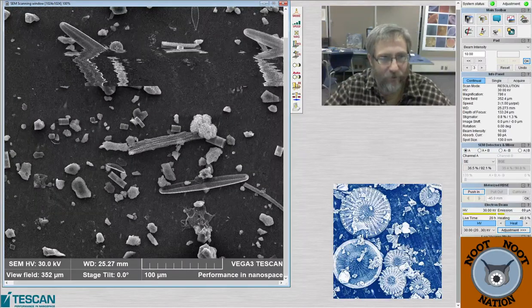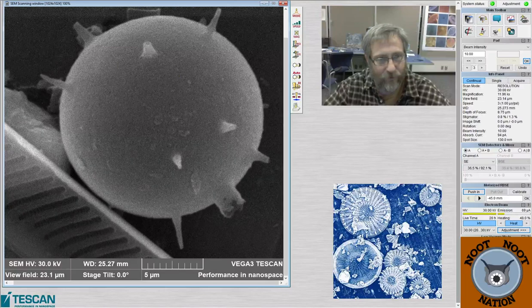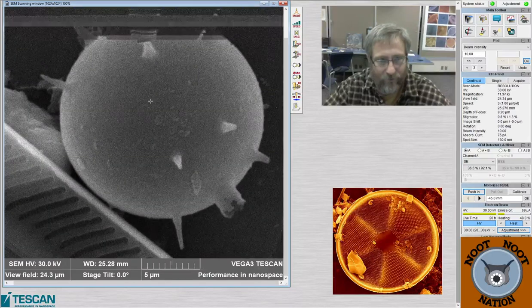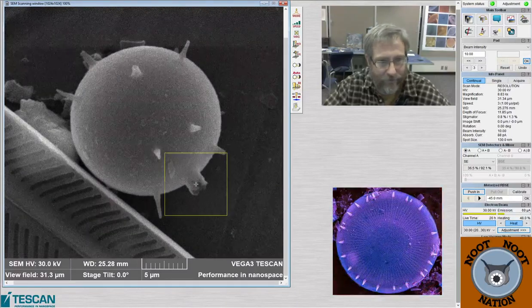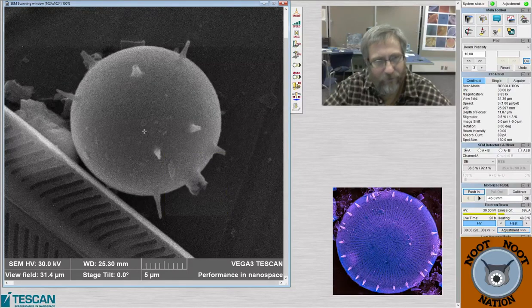I didn't spend too much time delving into it because it was just a project that I gave to Mallory to do, and when I handed it off to my photogrammetry person, they said, yeah, that didn't work. So you did something different, but I don't know what we did differently. It could have been something on the stage that was charging or creating a problem for the rest of the image. If there's a defect in the image, maybe it didn't know how to handle it. So it's a bit of a question mark what went wrong.